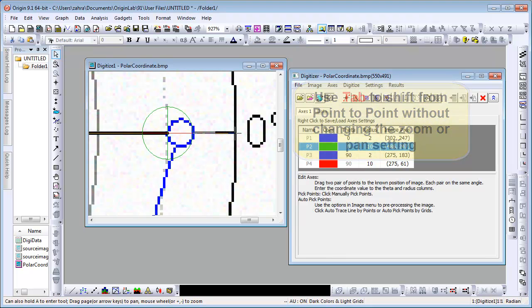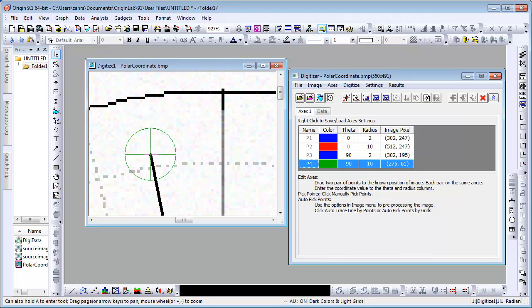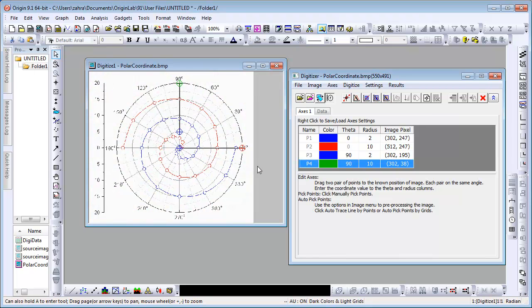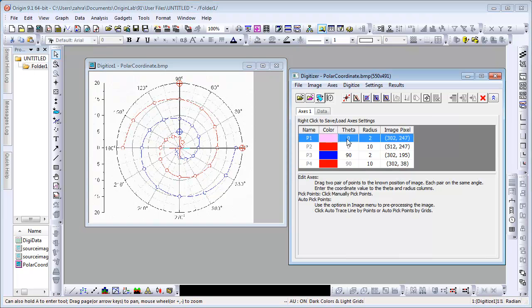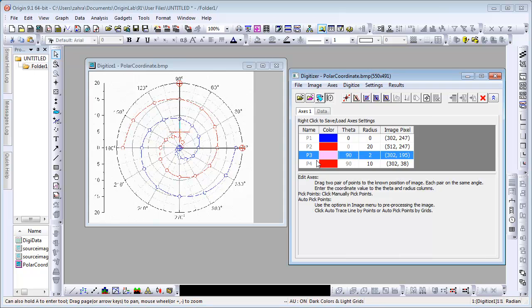Set all four points and then use Ctrl-W to zoom out and set the values in the Axis tab. P1 is at a theta value of 0 and according to the vertical axis has a radius value of 0 as well. P2 is also at theta 0 but has a radius value of 20. P3 and P4 are both at 90. However, you can read from the vertical axis that P3 is at 5 and P4 is at 20.